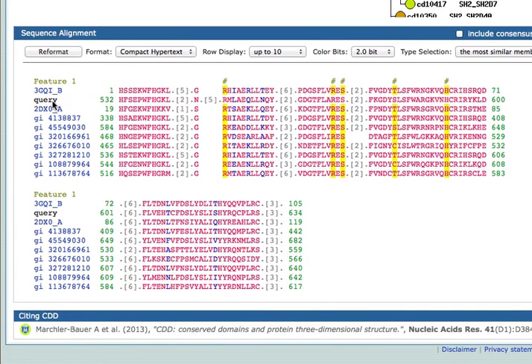The query is the one that we sent out. So this is our specific amino acid sequence starting at amino acid 532, HF, SEP, etc. And then it goes all the way down here to amino acid 634, and it ends up QCP, LRS, etc. So we need to find these amino acids on our protein and then identify the corresponding DNA sequence, and we'll do that in Biology Workbench.